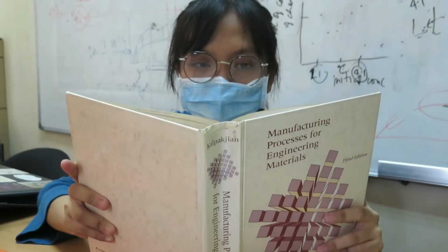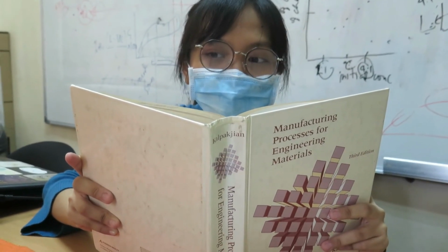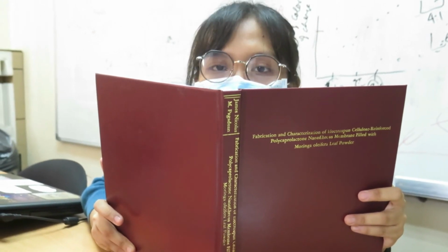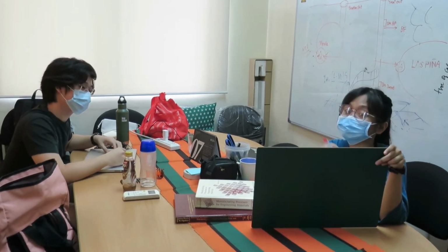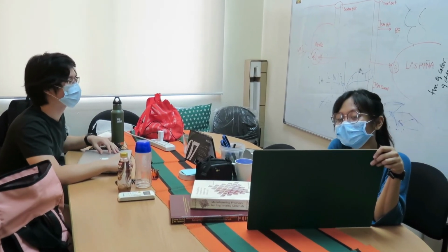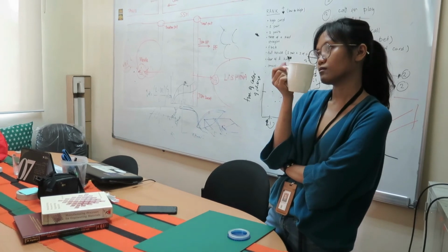data, really focused, reading a book, or reading a manuscript, or doing a research meeting with their research mates, or maybe just drinking coffee.